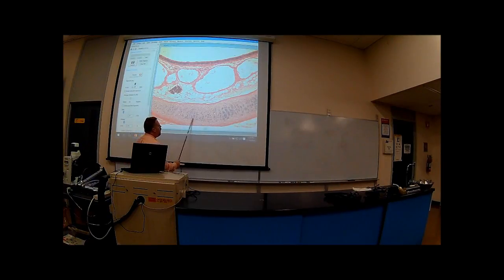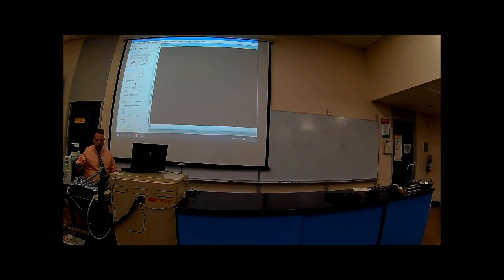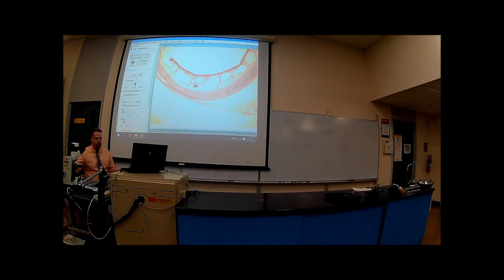You can pan everything. Here's the hyaline cartilage. There's the adipose tissue that you're seeing nicely over here. These are blood vessels, and they're loaded with red blood cells. You get up over here, and that's going to be your pseudostratified epithelium, then the cilia, and of course the white area up on top there is going to be the lumen. So you're looking at a tubular structure. Now, let's again get at a lower magnification. So we're back now to 100x. Okay, clear this up again.